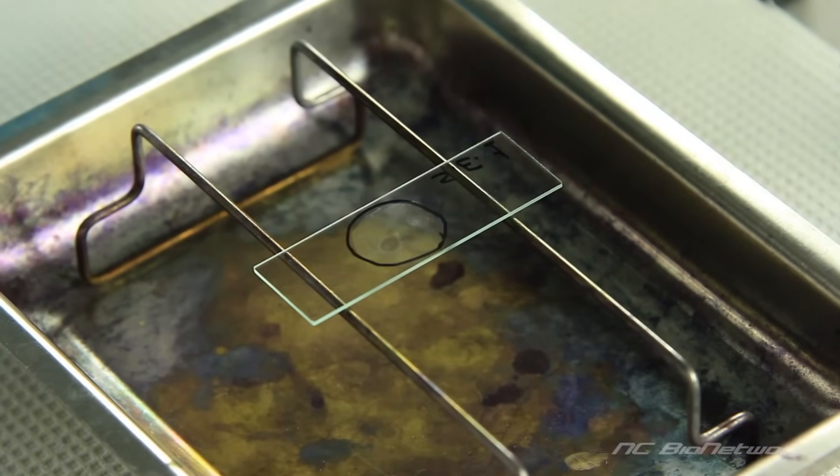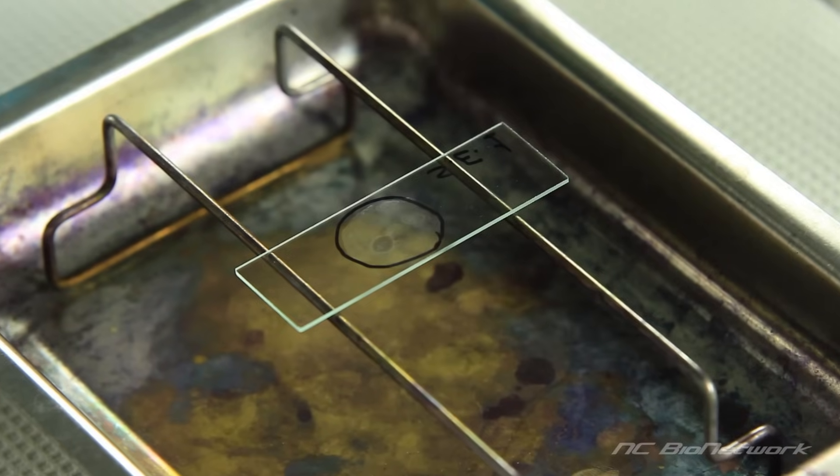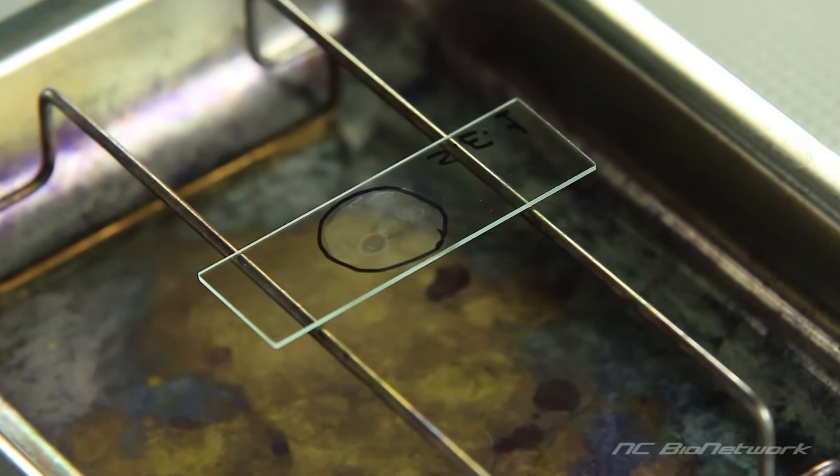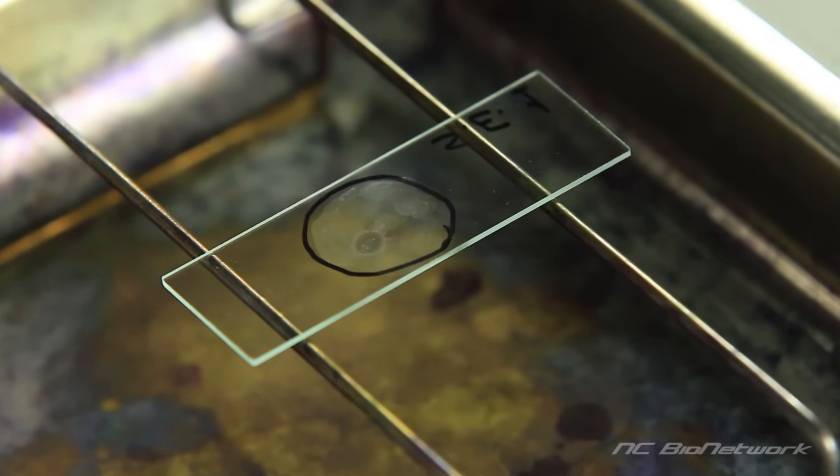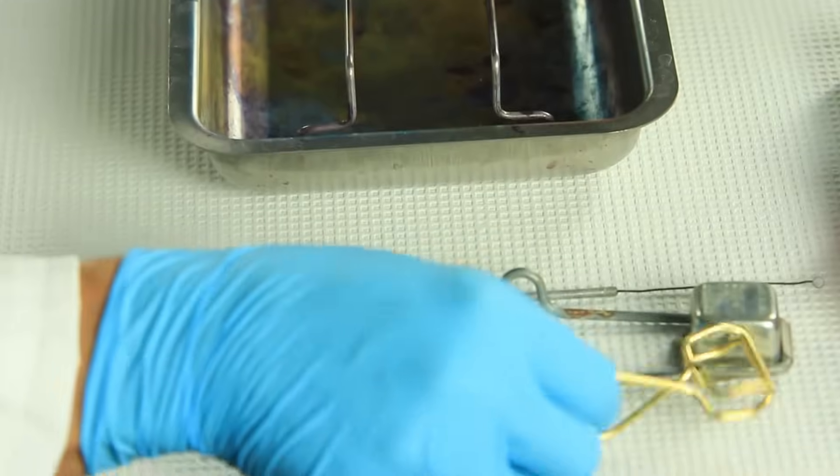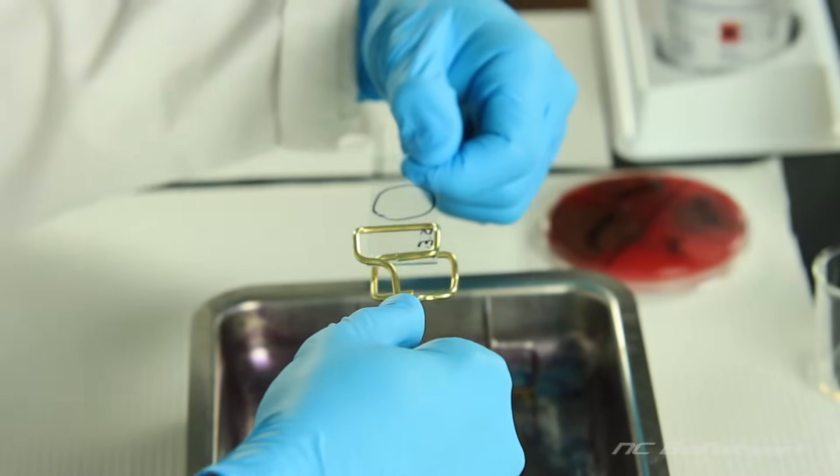Allow the slide to air dry at room temperature. The time will vary depending on the size of the smear. You will know the slide is dry when you see a thin white haze. Next, heat-fix the slide by passing it through a flame three times.